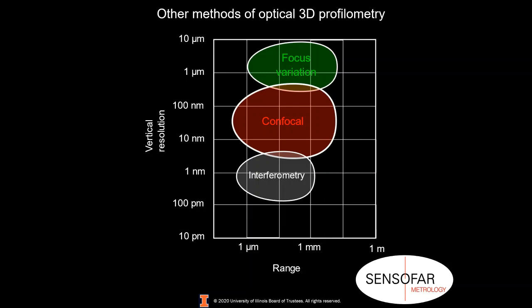So that's the case where if you want to see roughness of buried interfaces, XRR can do it. As Julio showed, if your top surface is transparent, you can sometimes do it if it's transparent to the violet laser. So if that's a special need that you have to see through the initial layer or two of your sample, then you might want to choose XRR.